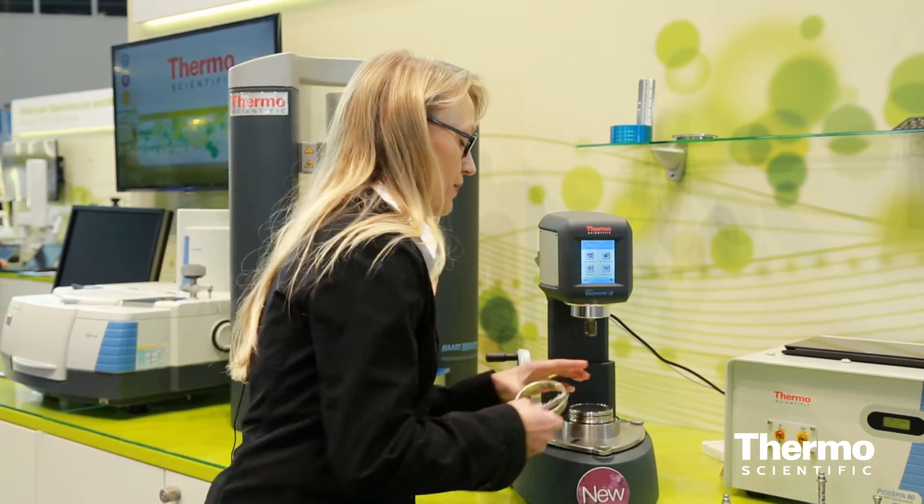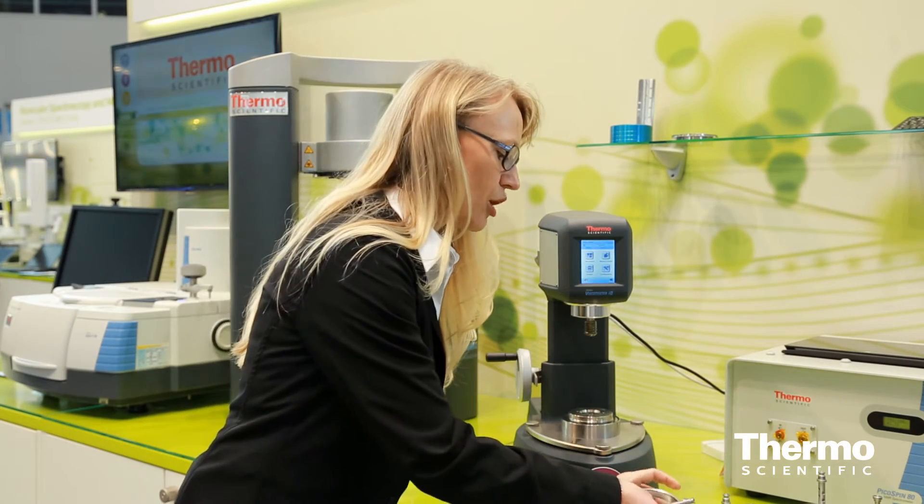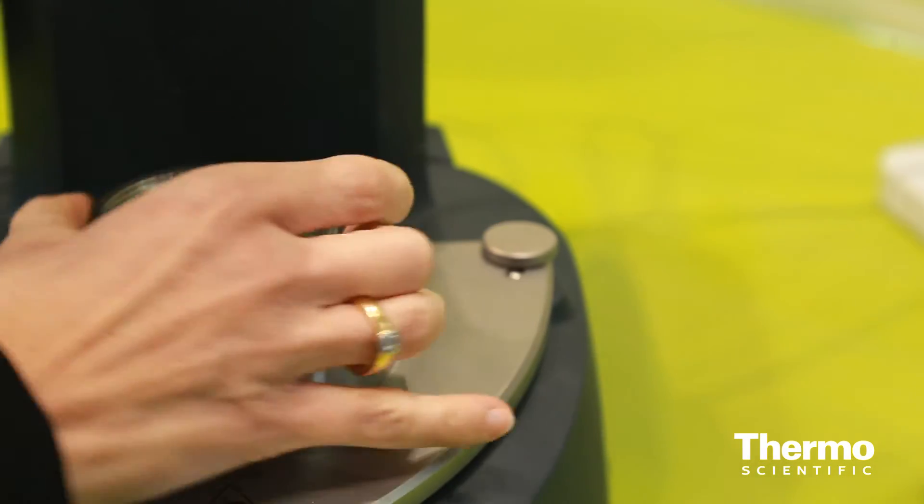The accessories are equipped for an easy exchange. A change between parallel plate geometries and concentric cylinders is a matter of seconds.